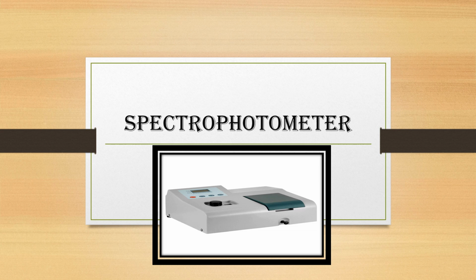I am going to discuss about spectrophotometer. As you know, a spectrophotometer is an instrument which we use in our labs for qualitative and quantitative analysis.